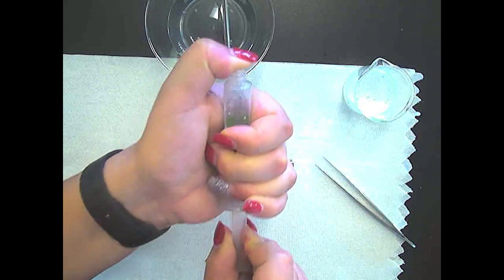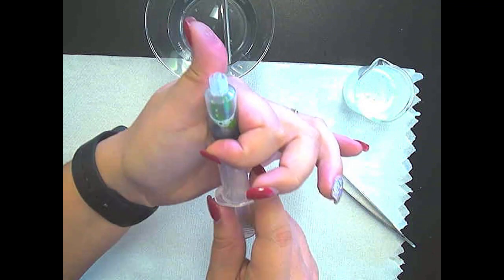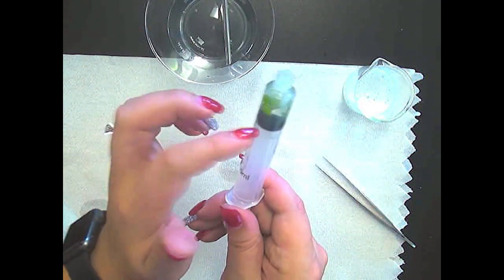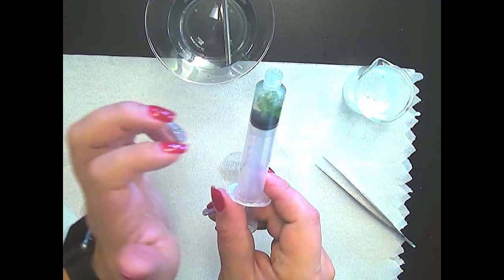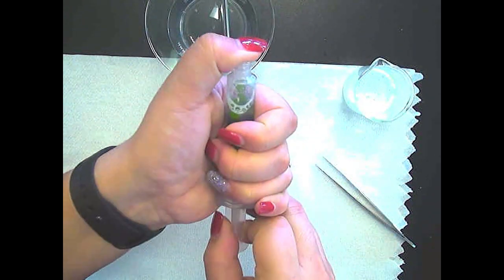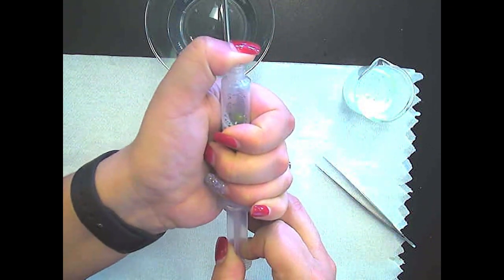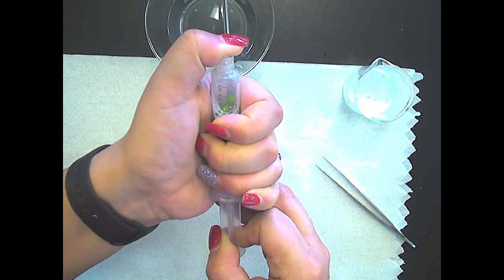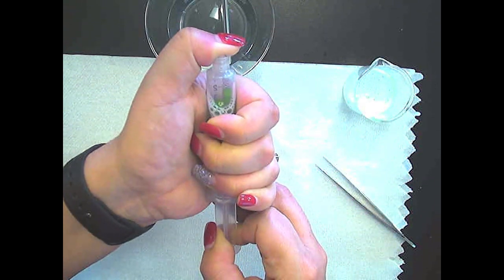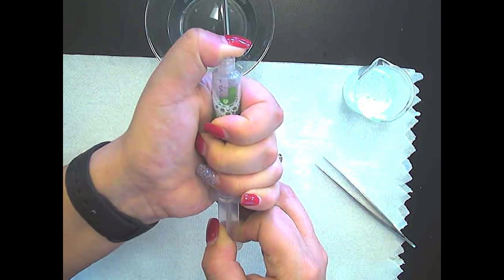But remember, we want to measure the amount of oxygen that's produced in our environmental conditions. I think one more time should be the trick. While you guys are doing this, I am going to tell you that the temperature of the sodium bicarbonate solution is 19.8 degrees. We will have thermometers as well as rulers, beakers, cups, forceps, some basic supplies for you guys.